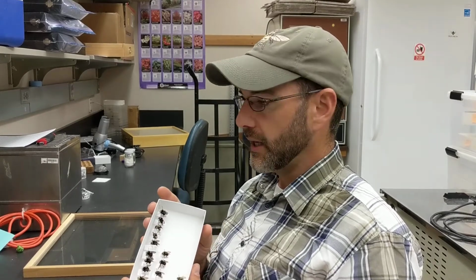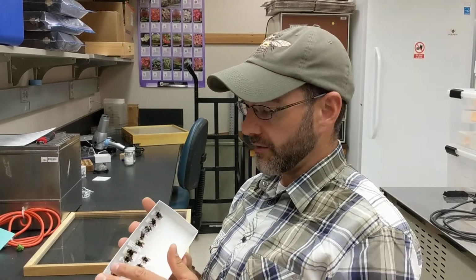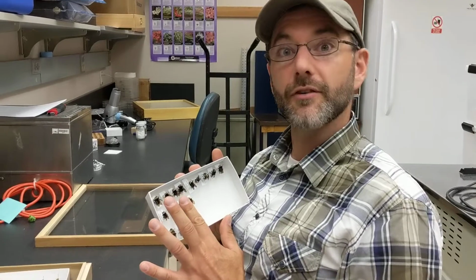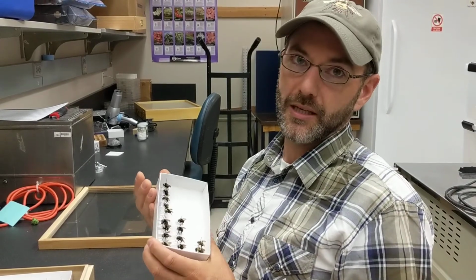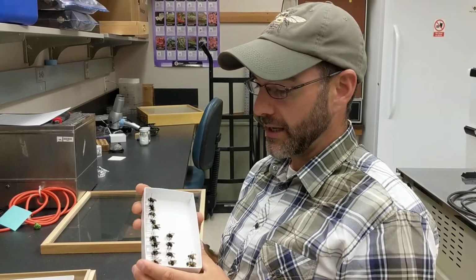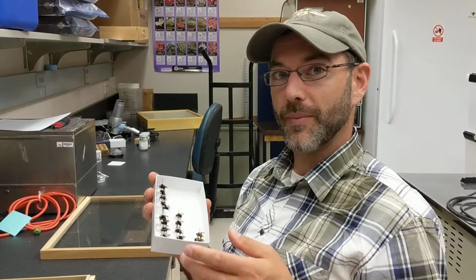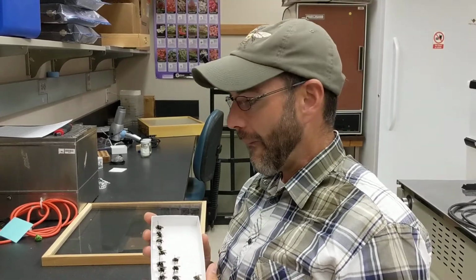And then also it's a learning process as well, because if you run all of these through the key, maybe you find that this one specimen is a different species, and so then you'll learn that specific character for that species, and then next time you sort your bumblebees, you have another extra piece of information you can use to sort them. And that's why when we just first started here, I said depending on how much experience you have will depend on how finely you're able to sort these things on a first pass.